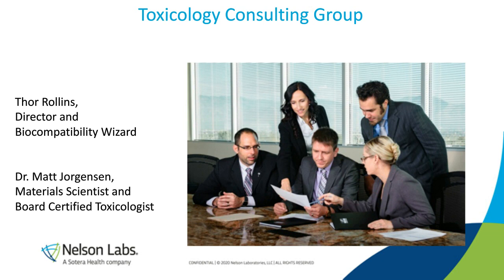Because as we've learned so far, the toxicologist and biocompatibility experts really need to inform exactly how this chemistry study is going to be done, right? And the toxicologist also needs to know what the biological endpoints are, or what the end objectives of the study are. And that's part of the reason why I love this slide.